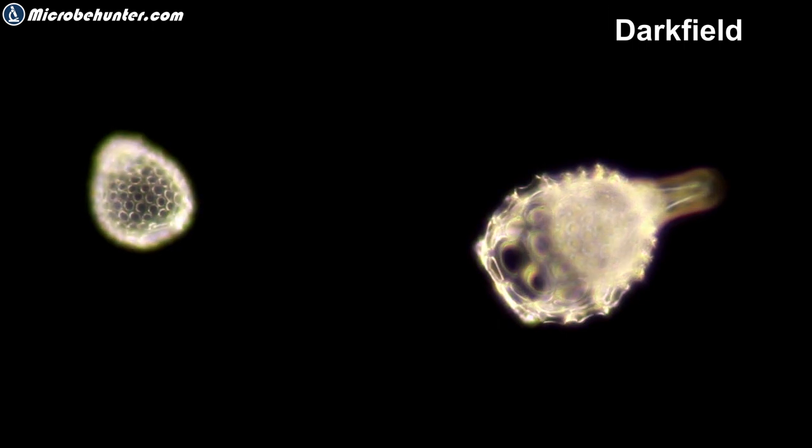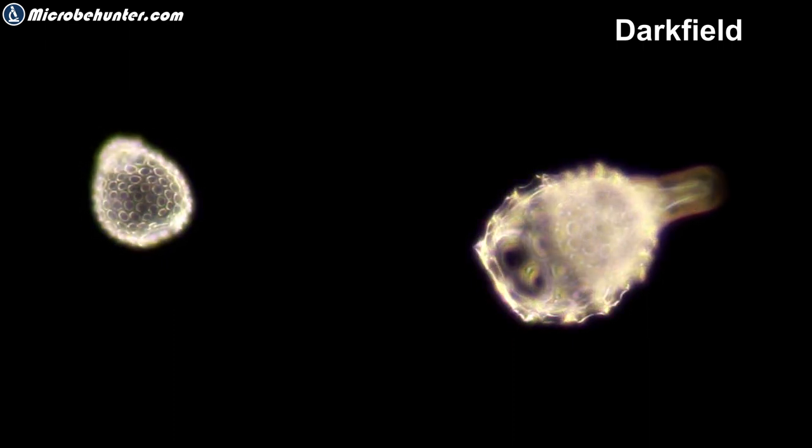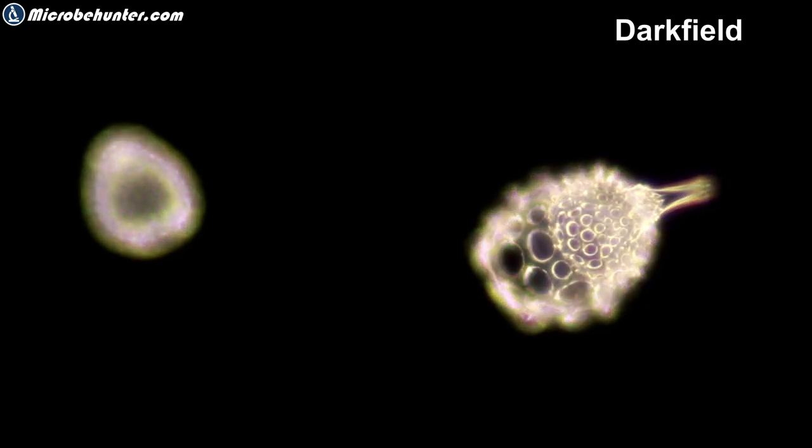That's the dark field image here. I'm focusing back and forth because the object is a little bit thick and therefore it's not possible for me to get all levels in focus at the same time.